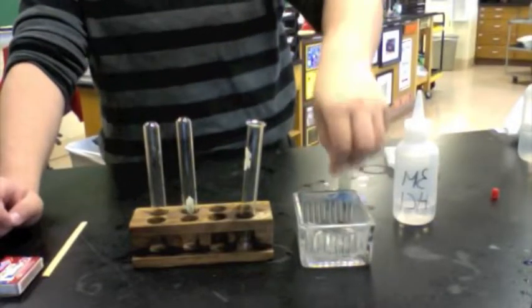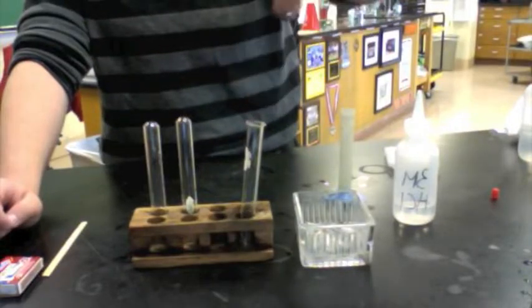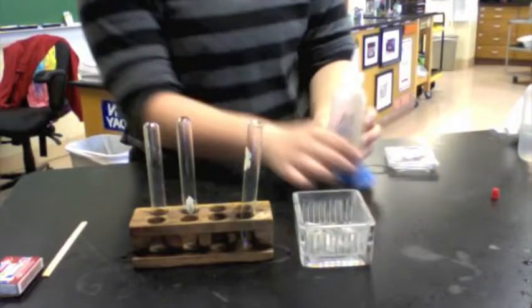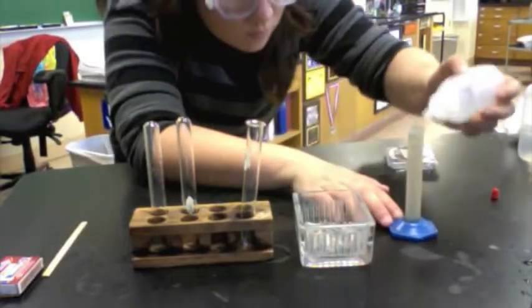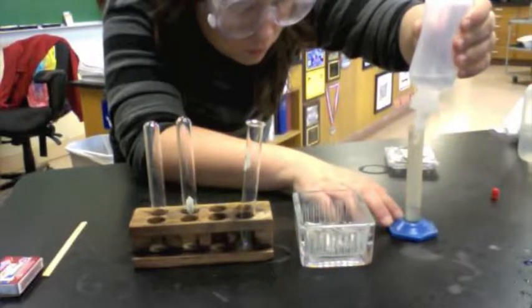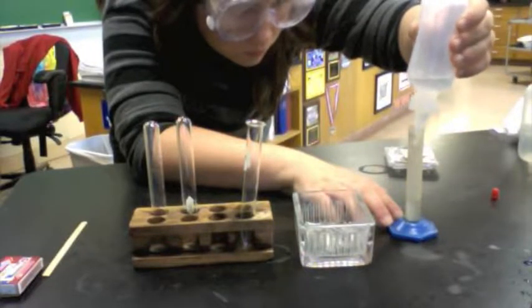Before starting the test, make sure you add the magnesium into the test tube. Once that is done, for our test we added 3 molar HCl and we used five milliliters of that, though it varies per each experiment.